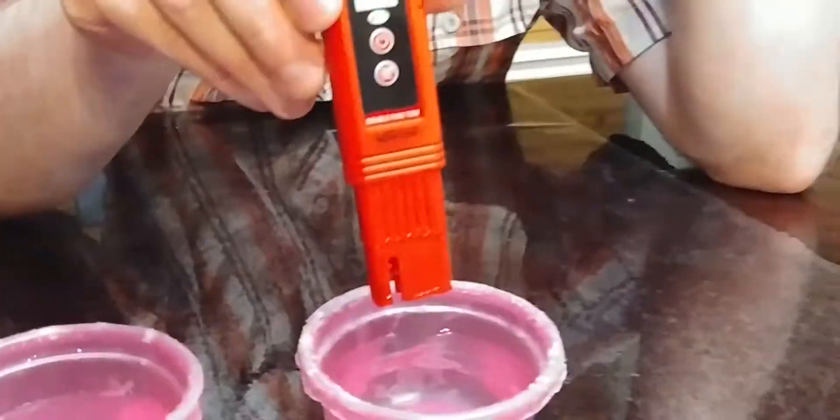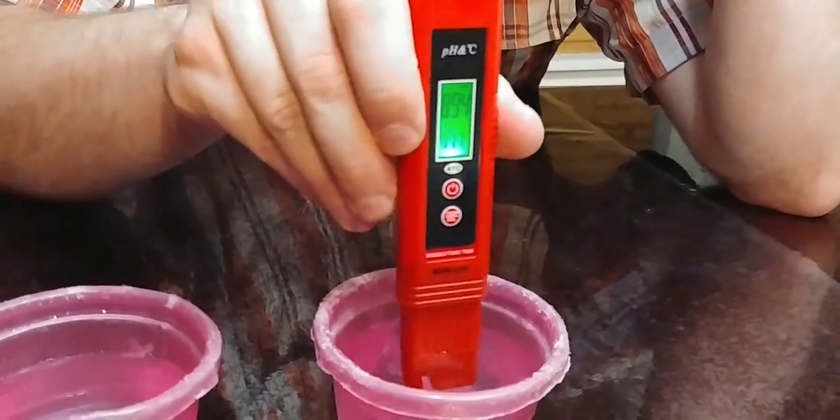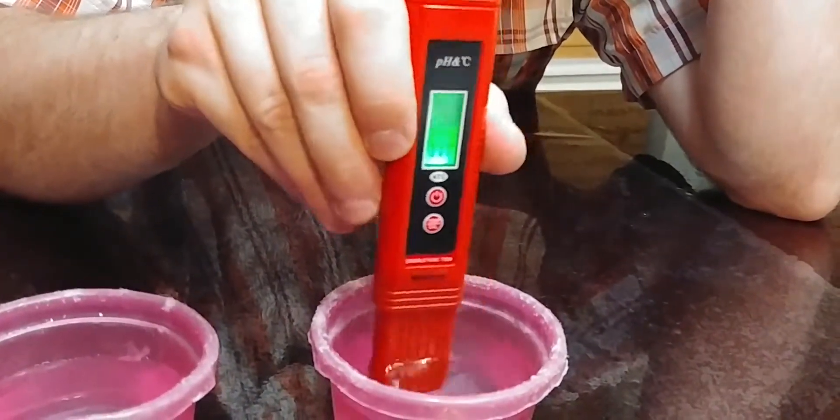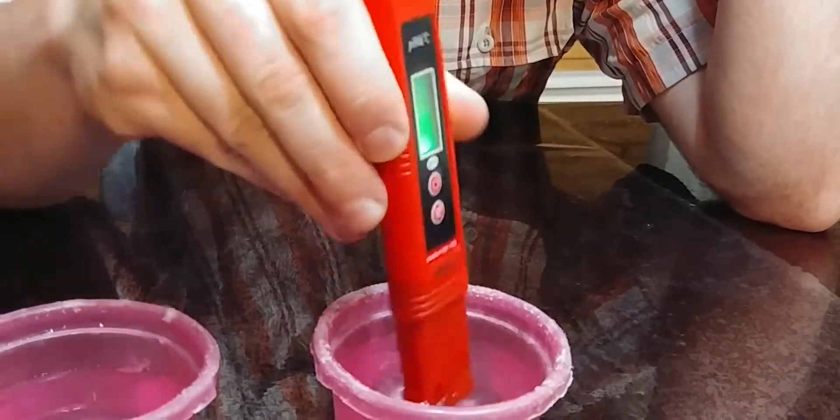So you can take it out of that one and we'll show you that it works with vinegar. This is vinegar so we should get a very low pH balance on this. We're just taking it in here, stir it around a little bit, and you should get like a one or two — and it's 1.7.